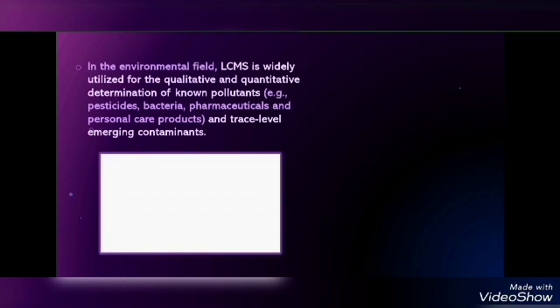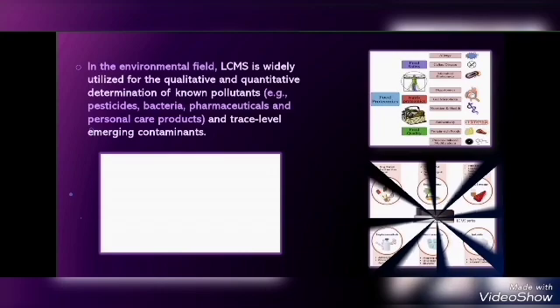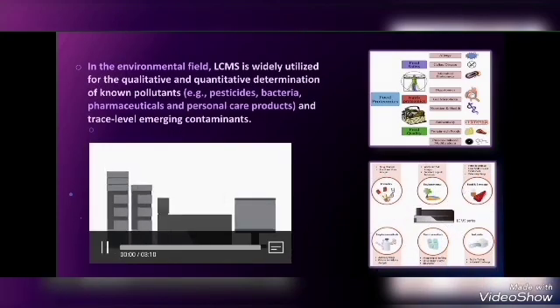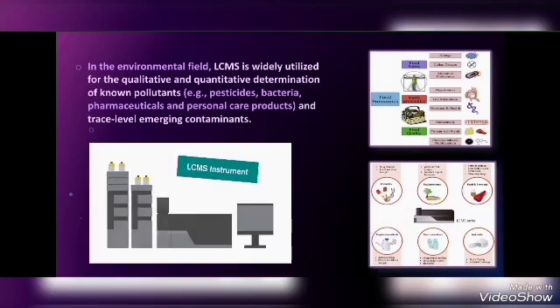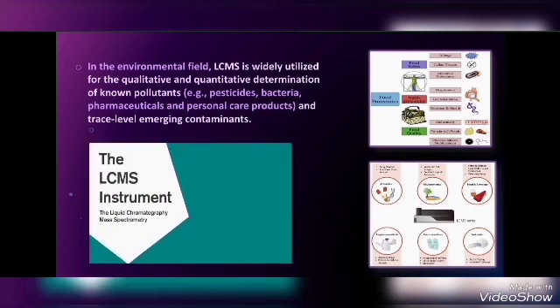In the environmental field, LCMS is widely utilized for the qualitative and quantitative determination of known pollutants, such as pesticides, bacteria, pharmaceuticals, and personal care products, and the trace level emerging contaminants. In LCMS instruments, it's used for detection of pesticides in essential oils and liquids.